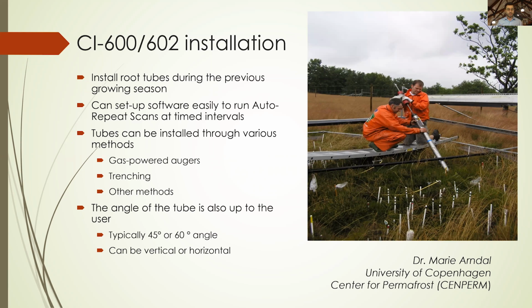The setup can also be used to do repeated scans. Now, in this picture from the University of Copenhagen, you can tell that they're inserting the 600 into a tube that's been covered in what looks like duct tape, just to make sure that UV light does not get in for their study.